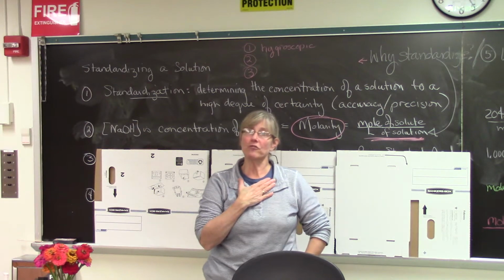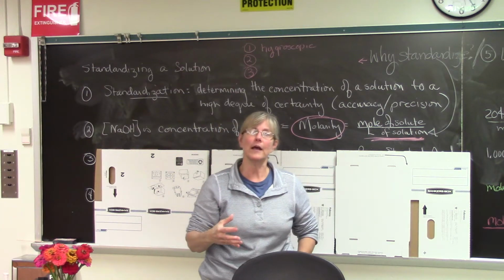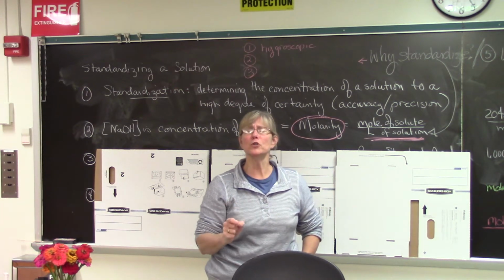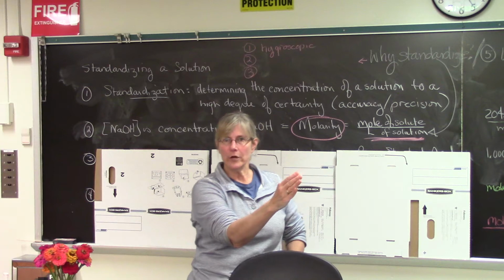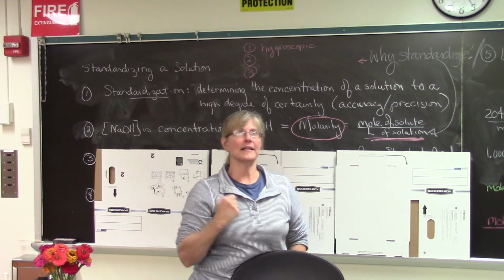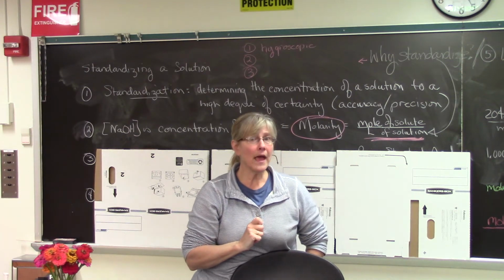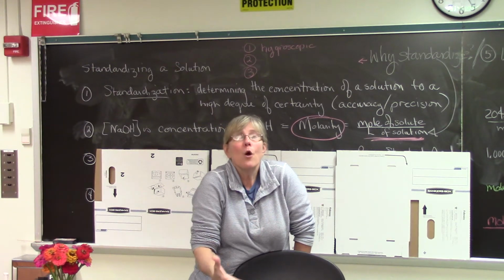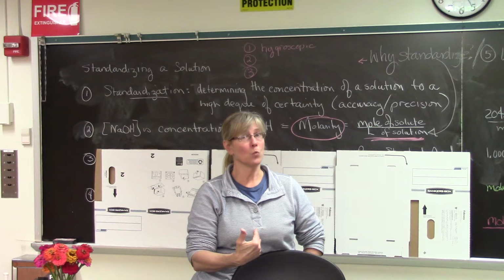Okay? So sodium hydroxide is actually a solid. You've all seen Drano. Well, Drano's got other stuff in it, but it is effectively sodium hydroxide. It's a solid, but it's also really, really hygroscopic. It absorbs water super, super fast. So literally, by the time I got some sodium hydroxide pellets onto my analytical balance, I'm going to be really good and make this mass as accurate as I can, as precise as I can. Put it on the analytical balance. By the time I write down the mass, that sodium hydroxide has already absorbed water. So I have no idea how much of that mass is sodium hydroxide and how much is water.